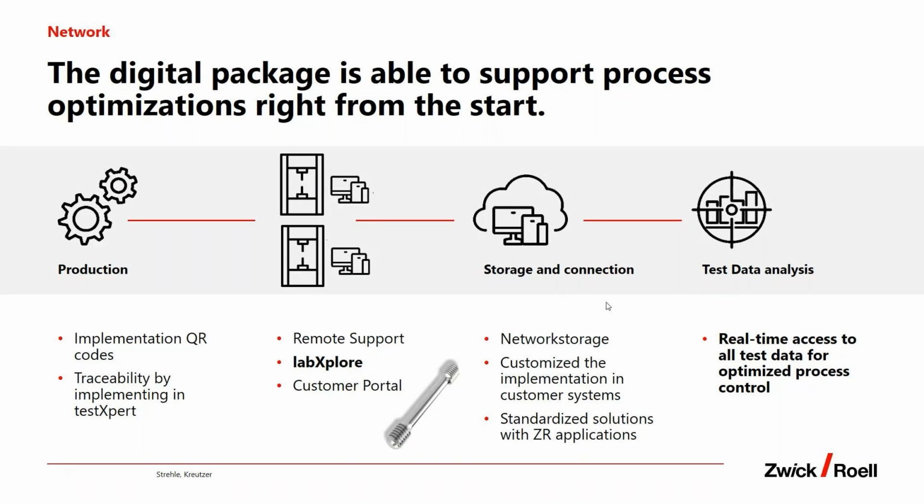You have a testing here in the center, where you are checking the product quality, the materials quality of your process. Then you have this connection to a storage, to a database, and with these web applications, you can do a test data analysis in any direction which you need. And around this process, testXpert is already supporting you in several ways.